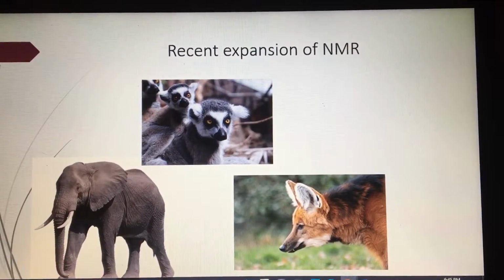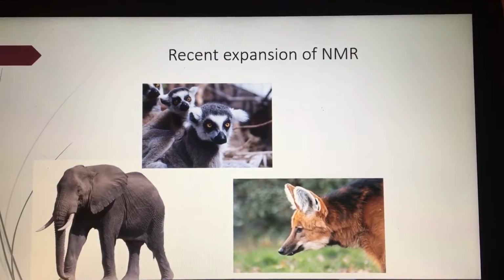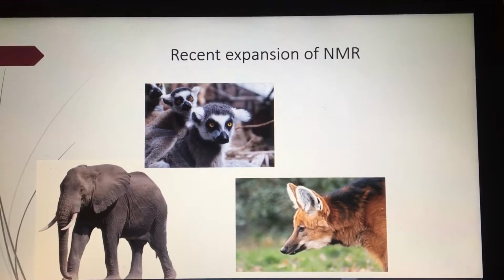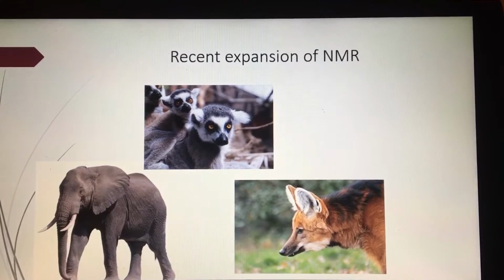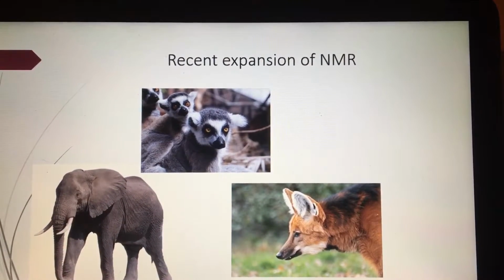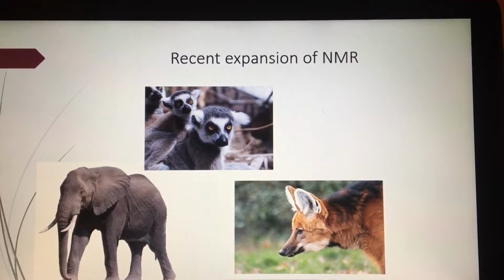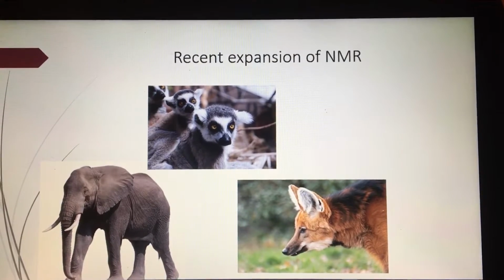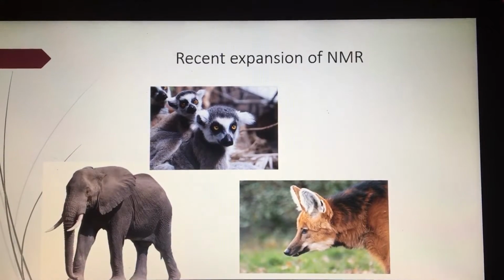In 2010, Hendrix College received a grant from the National Science Foundation to acquire a 400 MHz NMR spectrometer to enhance faculty and undergraduate research. The proposal was aimed at enhancing research training and education at all levels, especially in areas of study such as the synthesis of pyrrole-based biologically active marine alkaloid analogs and isotopically labeled porphyrin metabolites, discovering and characterizing mammalian chemical signals of endangered species like elephants, lemurs, and maned wolves.